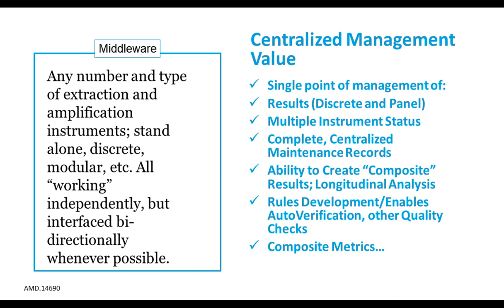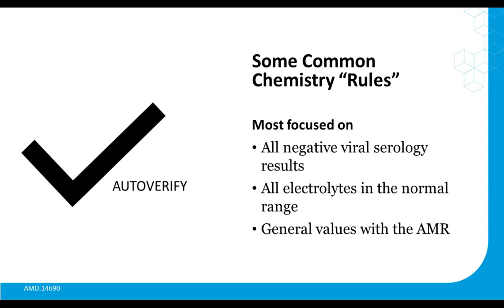It also allows, obviously, rules development and enables auto verification, which we're going to spend a little bit of time on, and other quality checks. But it really is only limited by your imagination and programming expertise. It's nothing more than a way of managing discrete data and categorizing it in a way that makes sense for your laboratory.